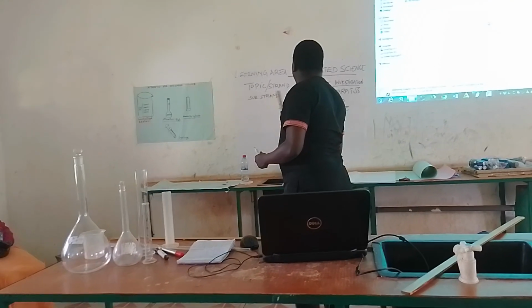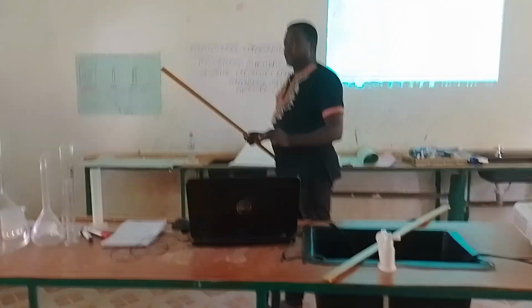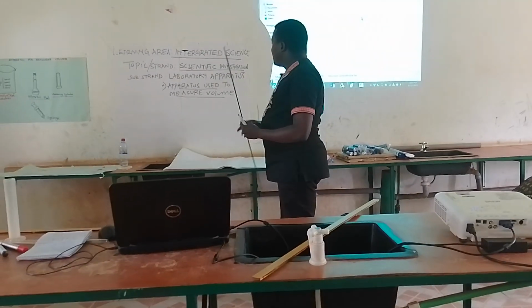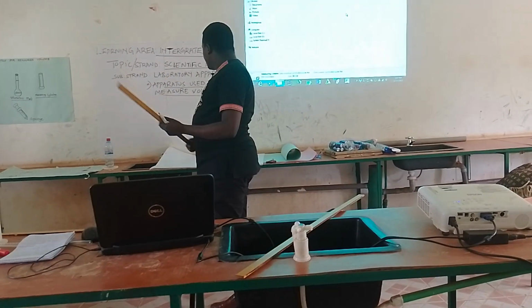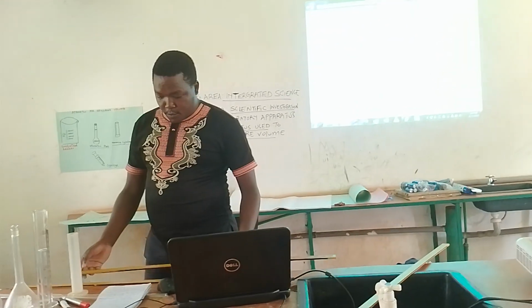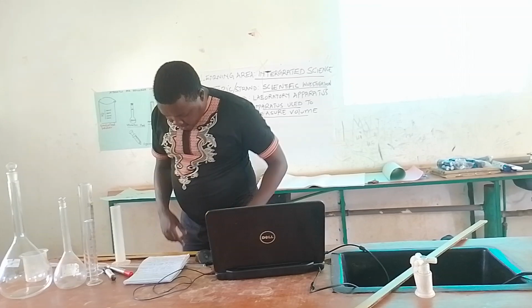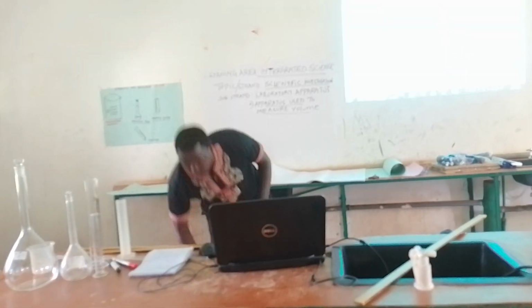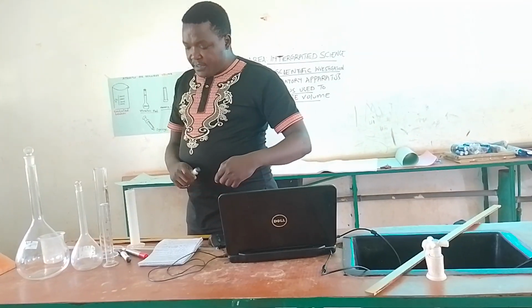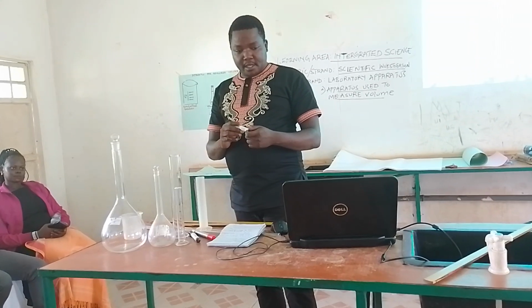Our topic is scientific investigation, and we are checking on the part of laboratory apparatus, the part whereby we look at apparatus used to measure volume. The question that I want us to ask ourselves is: what are some of the apparatus that are used to measure volume?